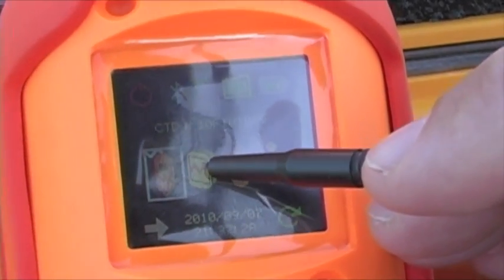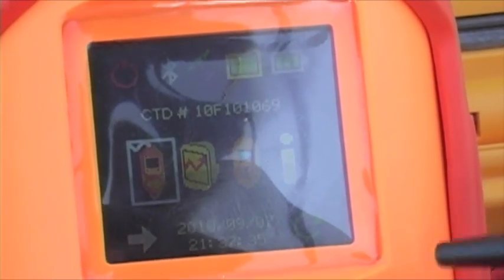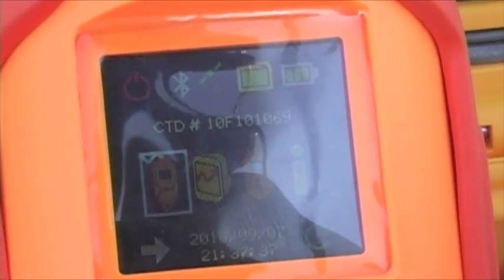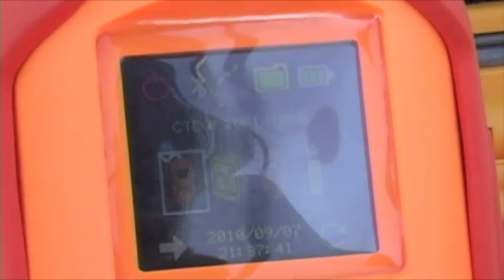We have the File icon, which is where you would view files that you've already done. You have the Point Measurement icon, which is where you would take point measurements — say, the Castaway at a single depth where you want to get a bunch of measurements at a single depth. And then there's information about the system itself.